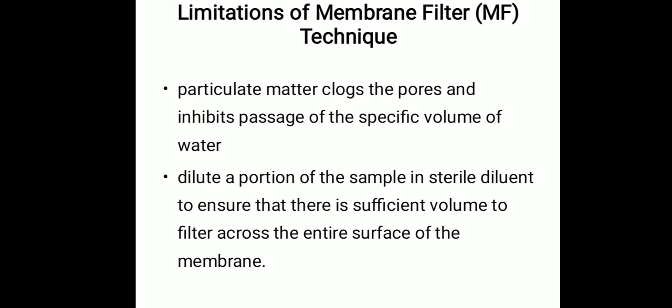Another limitation is that when small quantities of sample, for example of sewage effluent or of grossly polluted surface water, are to be tested, it is necessary to dilute a portion of the sample in sterile diluent to ensure that there is sufficient volume to filter across the entire surface of the membrane. These are the limitations of the membrane filter technique.